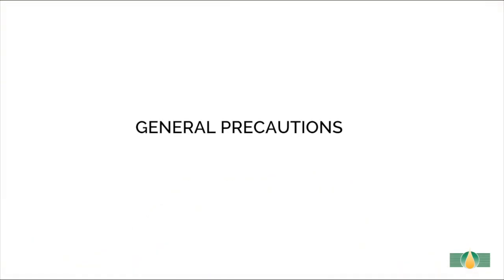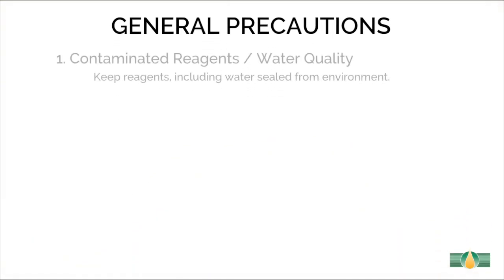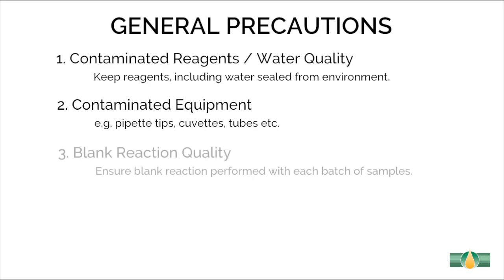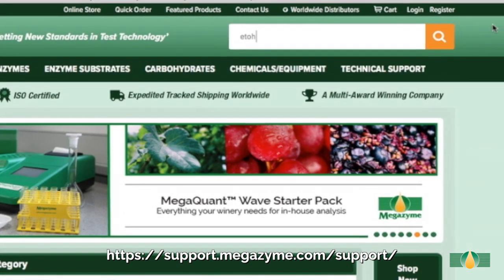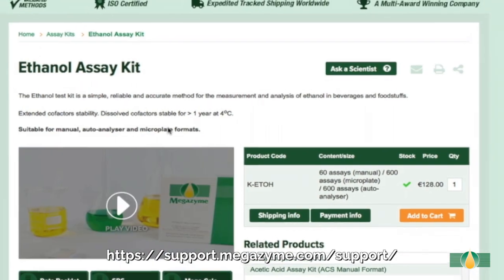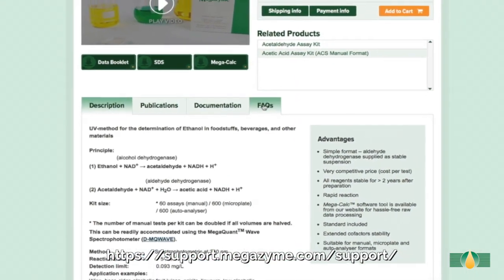As with all enzymatic ethanol assays, MegaZyme's ethanol kit is extremely sensitive. Equipment contaminated with very small amounts of ethanol, or even ethanol absorbed by the assay reagents from the atmosphere, will adversely affect the assay results. Therefore certain precautions must be taken when performing the assay, especially in environments such as wineries where large quantities of ethanol or other primary alcohols are present. For more details regarding these precautions, please visit the ethanol kit frequently asked questions section on our website.